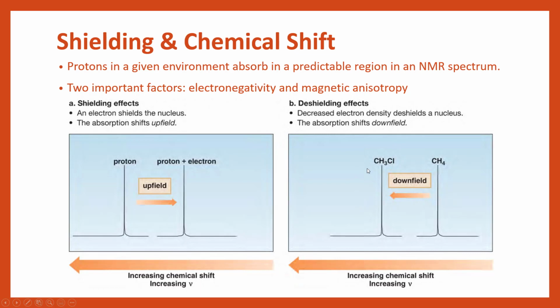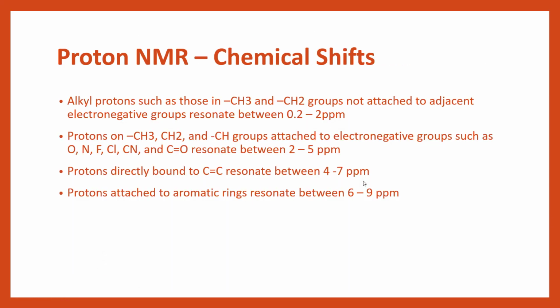So what we'll begin to find, as we go through some example spectra, is that when you have electronegative groups like chlorine, fluorine, bromine, iodine, oxygen and nitrogen in our structure, we will typically see the hydrogens that are neighbouring them pushed further down. Okay, so that's the trend we're looking at.